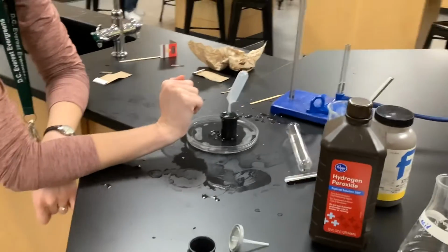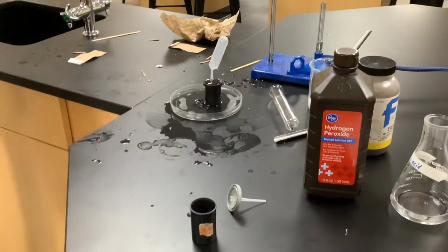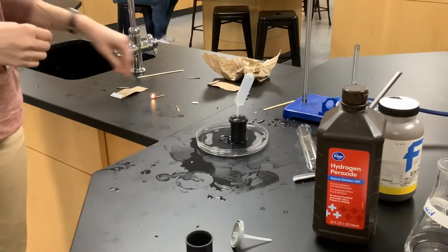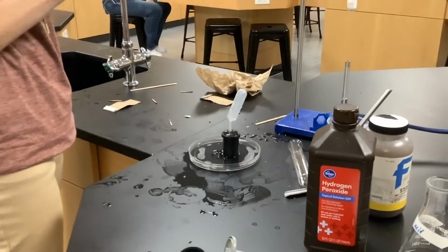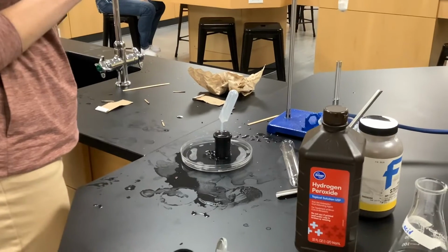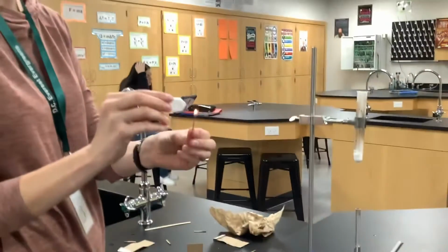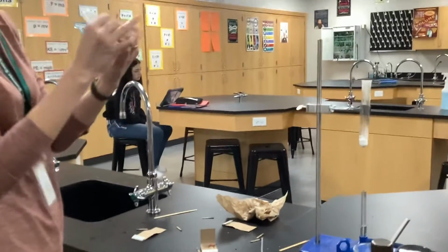What does hydrogen gas do with a flame? It explodes. Yeah, it does. This one's kind of a little bit lame, but we're gonna get a little bit of a pop. You can still hear it though. Nope. There we go. Okay. That wasn't bad. There we go. So we heard that little tiny pop explosion.